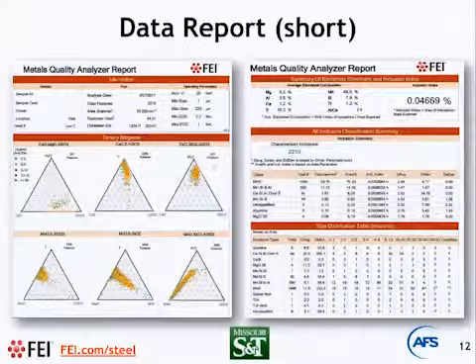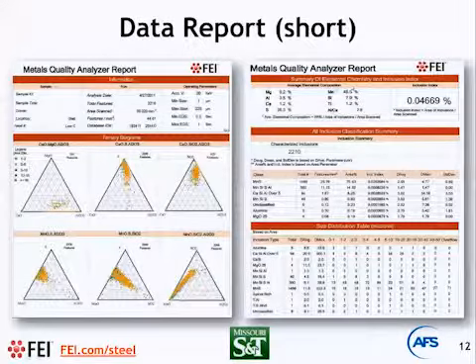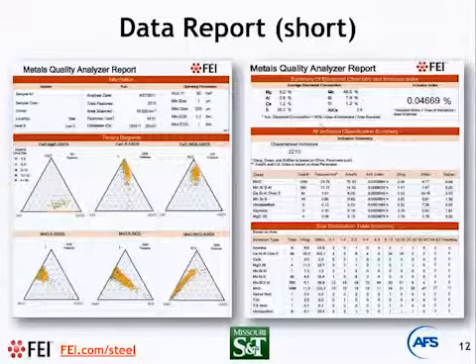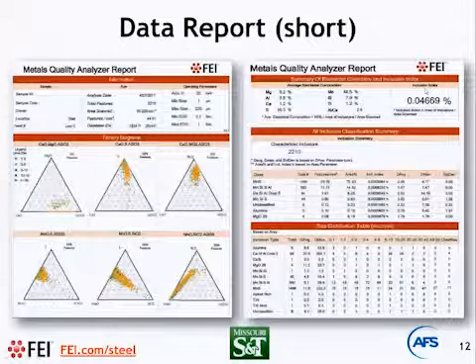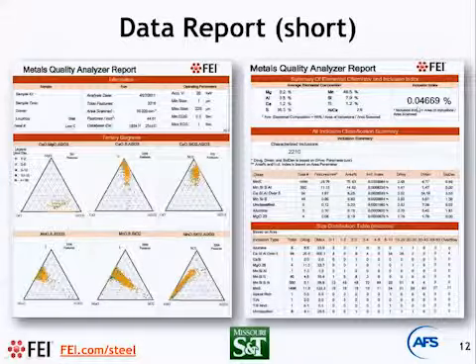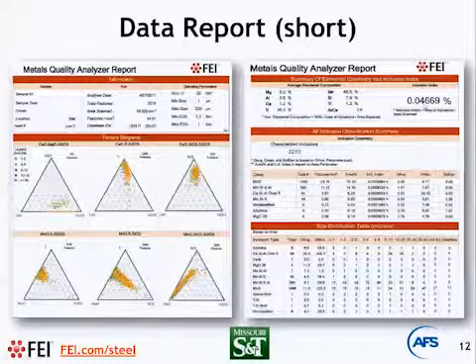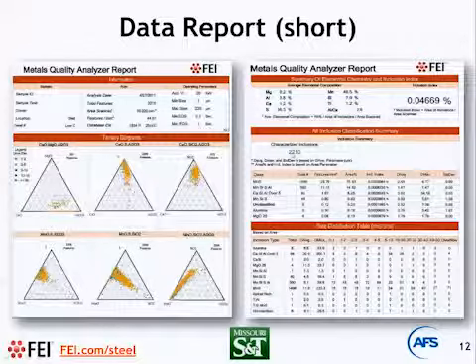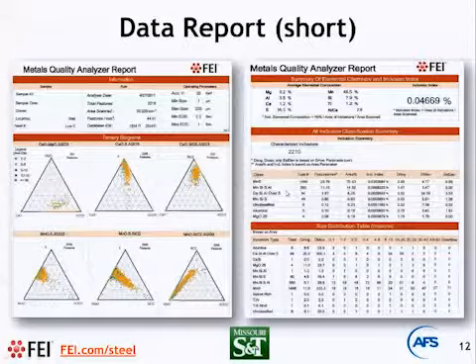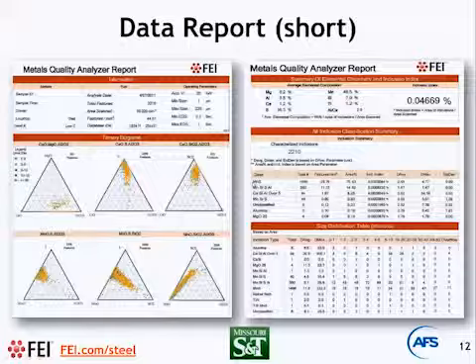Okay. On the right side, it also shows a breakdown of inclusions by chemical composition for each class of composition. These definitions can all be defined by the user, and it also shows the inclusion index, which is based on the total area of inclusion on the total area of samples. Okay, so these are just examples, and depending on the use cases, the report templates can all be customized. Okay, so next.